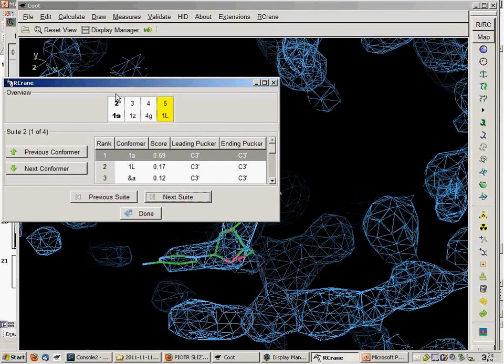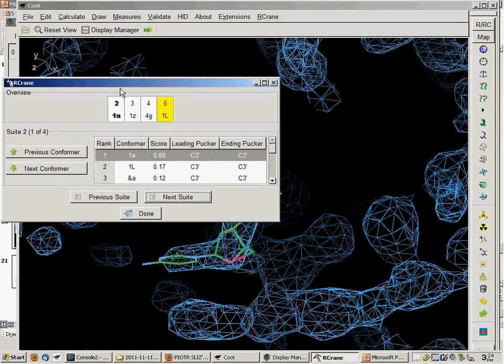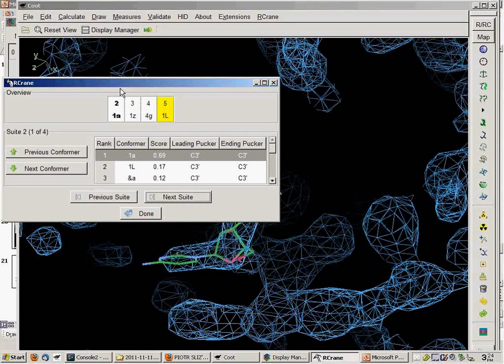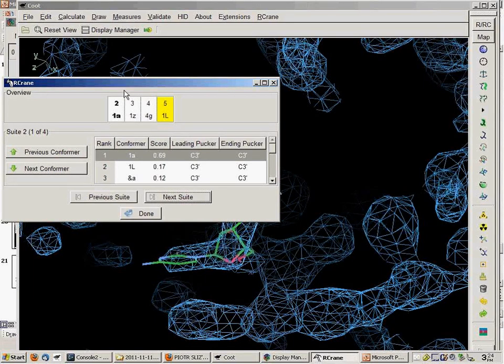Great. There's also questions from the audience. There was another question, if you could at some point go back and repeat to show people how to place this first phosphate. Sure, I can do that. Okay. I'm just planning on doing that in a minute anyway for something else.